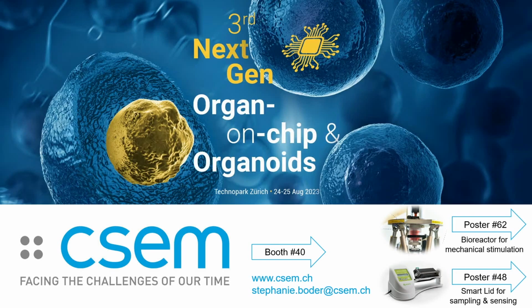Thank you for your talk. I'm just wondering how you create the liver organoid. What types of cells are used to create the liver organoid? What cells are used to create the spheroids, you mean? The liver organoid. There are 3 types of cells: the hepatic cells, the mesenchymal stem cells, and the endothelial cells, so HUVEC.